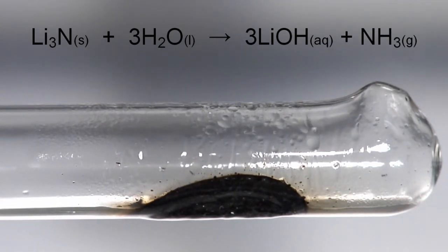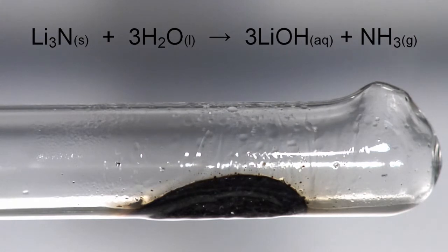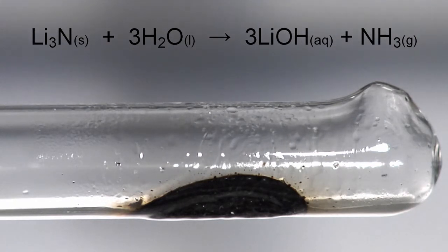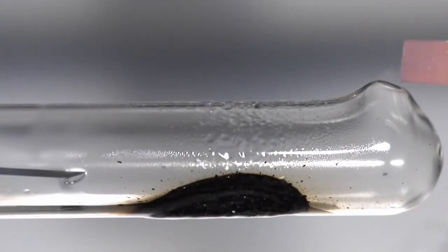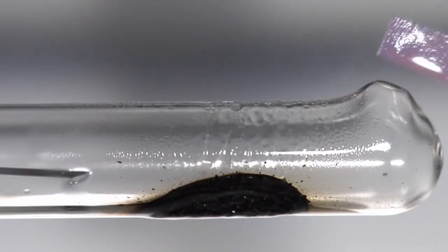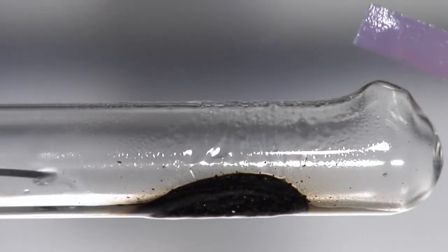The ammonia gas can be detected by holding moistened red litmus paper to the nozzle of the tube. The red litmus paper turns blue as the ammonia dissolves in the water on its surface.